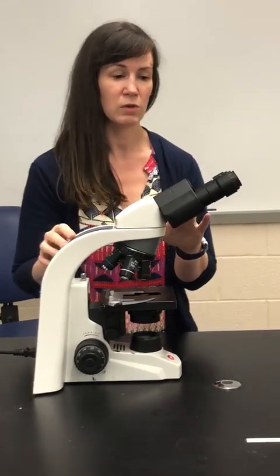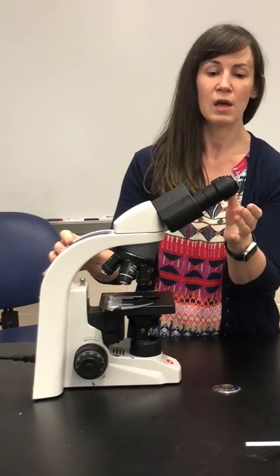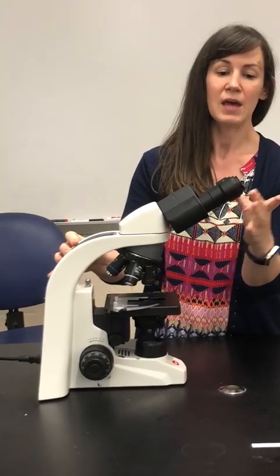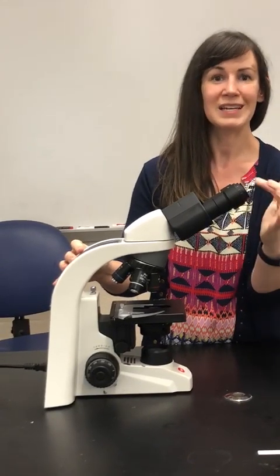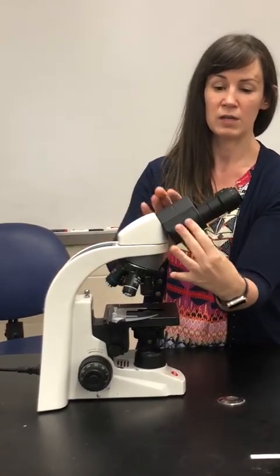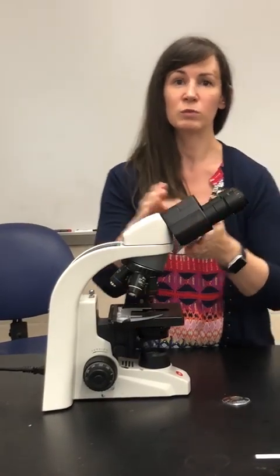We use binocular light microscopes, so they have two places for you to look through. These are called your oculars. They're also called your eyepieces. This is the first part of magnification. So there's a 10x lens in each one of these oculars, and they can be moved in different ways to try to make them more comfortable for your face.